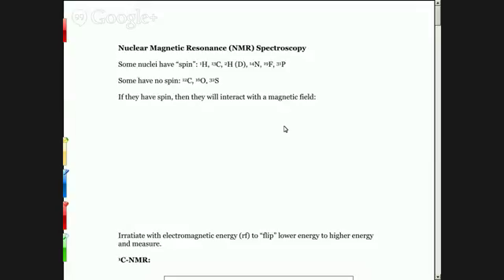That's important because when we put a molecule like this into the NMR, we're going to get one peak from that group of six, and then one peak from that group of two. So those groups are chemically distinguishable from each other. We would say they're in different groups, and we see different peaks for them. All right, what if we add a fourth carbon? So butane, what do you think? How many groups of hydrogens would be in there? Yeah, the middle four versus the end six. So you would get two groups of hydrogens.